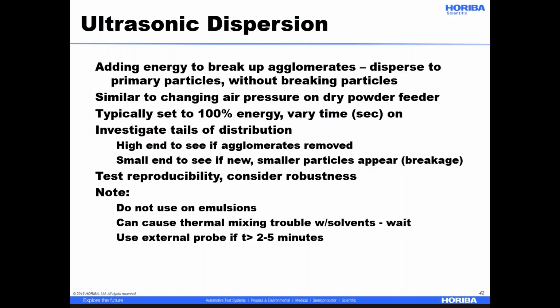If I have an emulsion, I won't do this because all sorts of exciting things will happen as those sound waves go through the droplets, leading to confusion about results. If you're using ultrasound on a system, generally they tend to be weaker than the standalone ultrasound systems you can get. So you may use a standalone system to pre-disperse your sample before measurement.